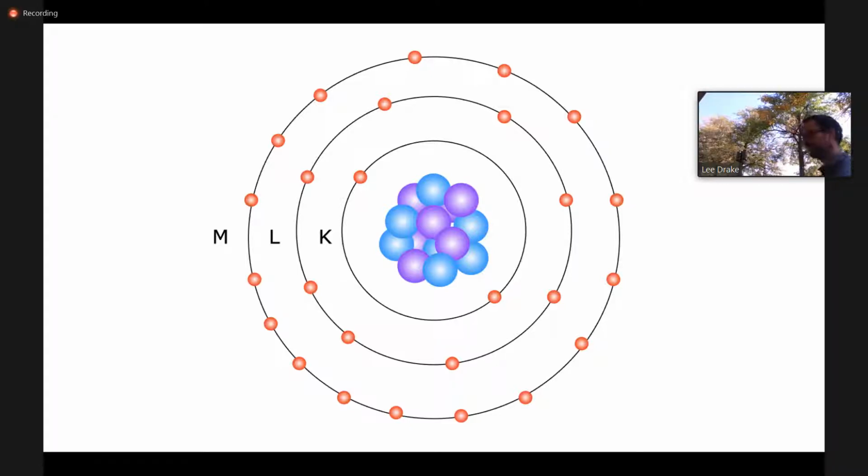In fact, it's not even really the atoms that you see. When you have a pure element like iron or manganese or any of the others, they typically just look dull and gray to us, nothing too special. So what you're typically seeing when you see visible objects is the electrons that are bound in some kind of compound state. With X-ray fluorescence, these extremely high energies, we really dig deep in.